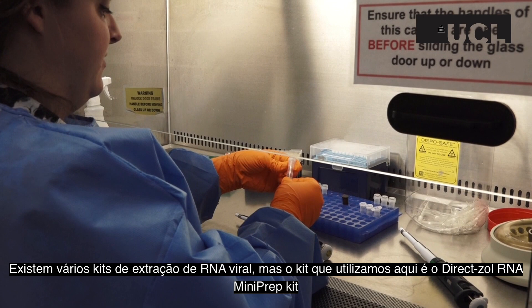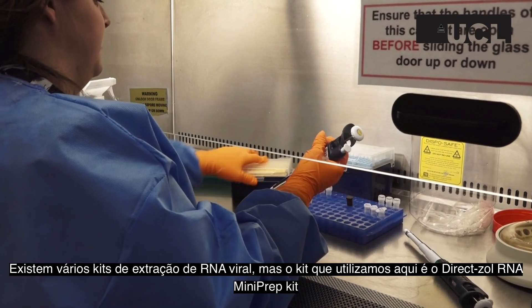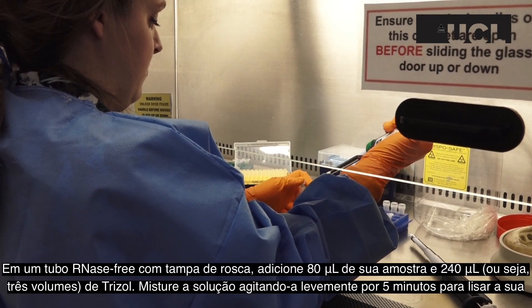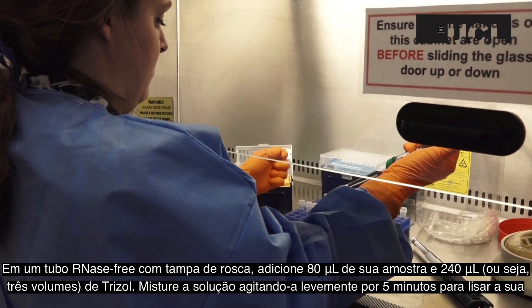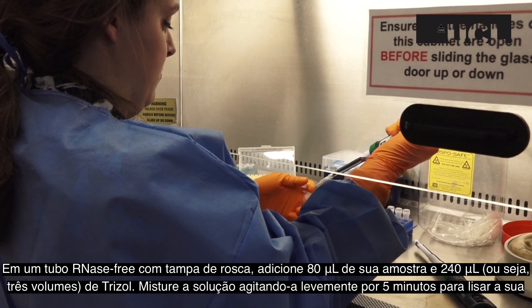There are lots of kits that can be used to extract viral RNA, but the kit used here is the Direct-zol RNA mini prep kit. In a new RNase-free screw cap tube, add 80 µl of your sample and 240 µl — so three volumes — of trizol. Mix this thoroughly for five minutes to lyse your sample.